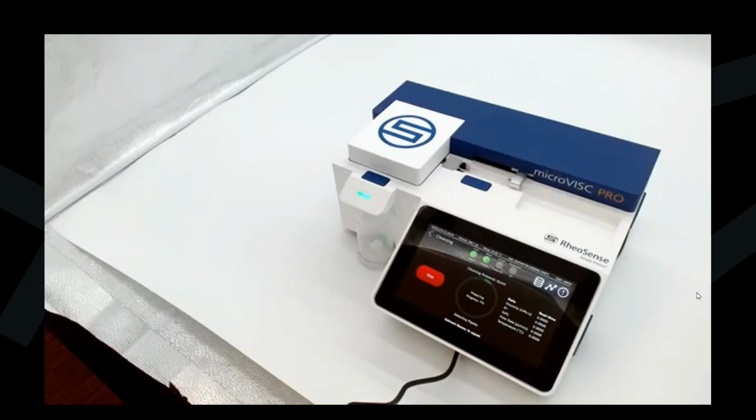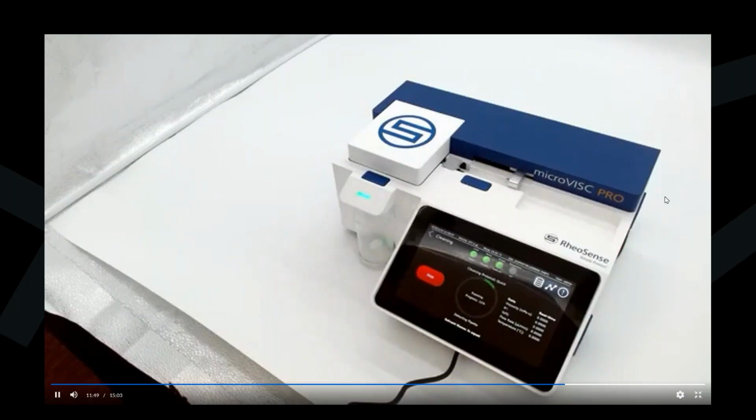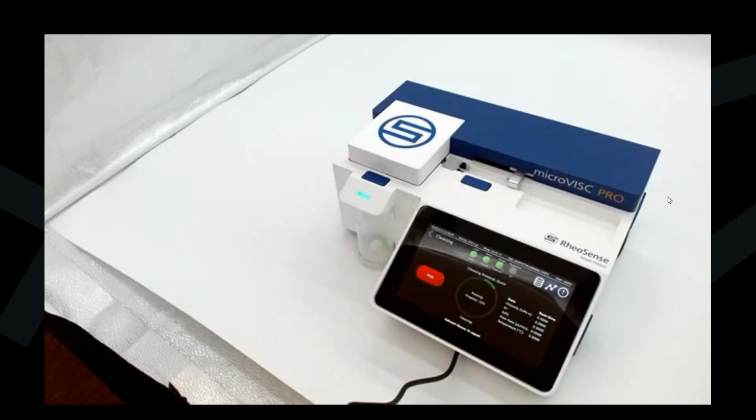So now again, the pusher block is going to go ahead and detect the pipette. After it does that, it's going to push all of the sample until the entire pipette is empty. So here you can see in the window and the screen, it's showing you the progress of the cleaning. So 0 to 100%. These cleaning steps are unique because the way this mode cleans is that it has multiple cycles of cleaning.